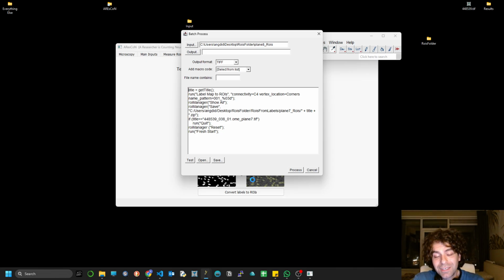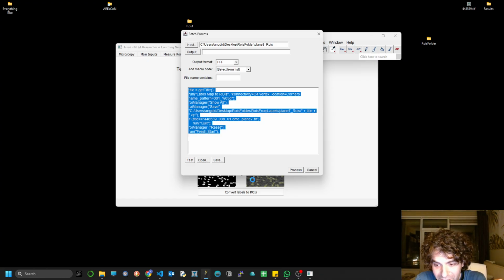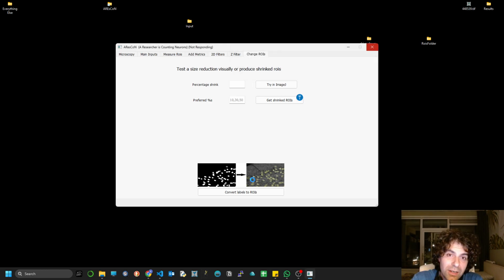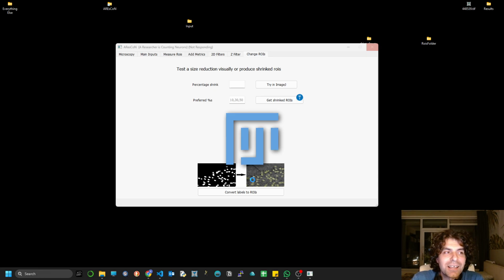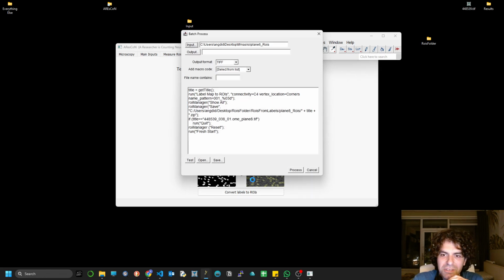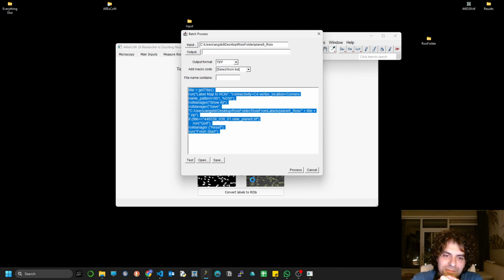And that might sound trivial. However, there is a particular function that we're going to use later for detection of the relative background. You'll see what I mean. And the truth is that in that case, it's slightly better to have this gap in between observations. However, it's not something that we cannot resolve. So it's really okay. Okay, last plane, which is good. Let's wait for it.